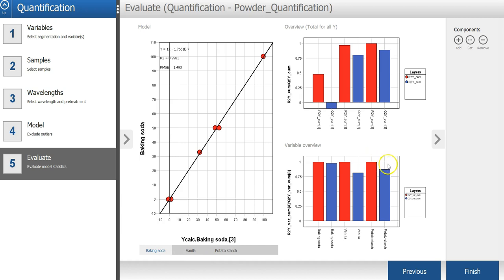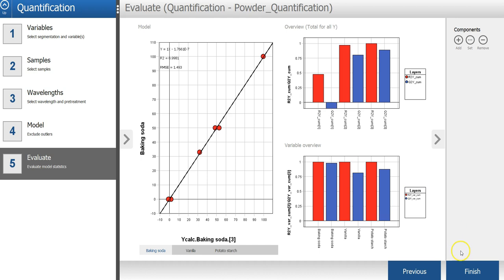The variable overview is showing the R-square and Q-square, but for each individual variable. Everything looks okay here, so let's press finish to complete the model.